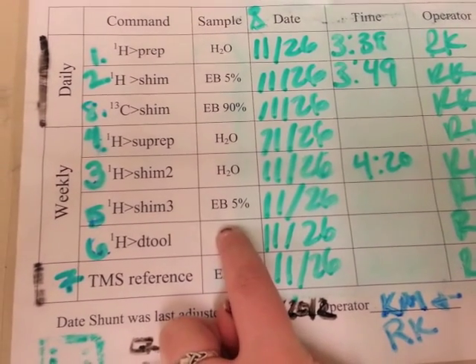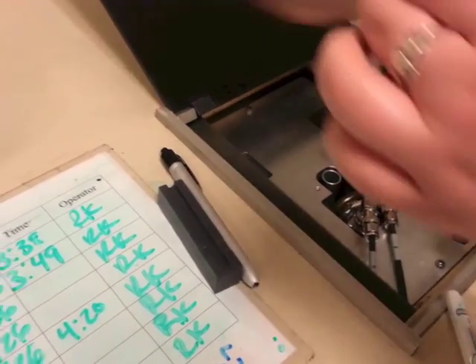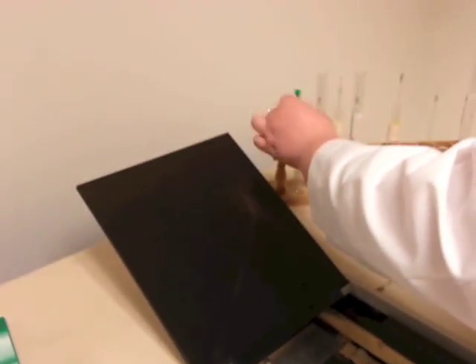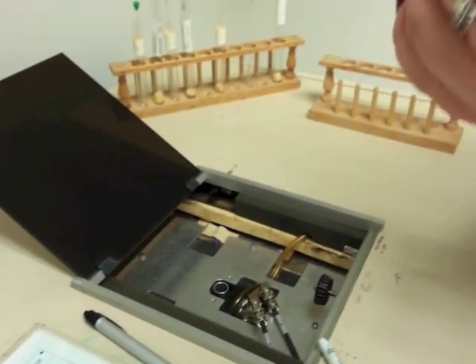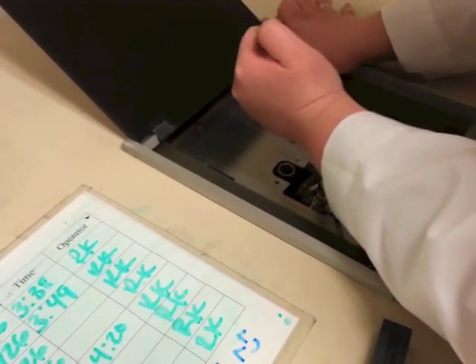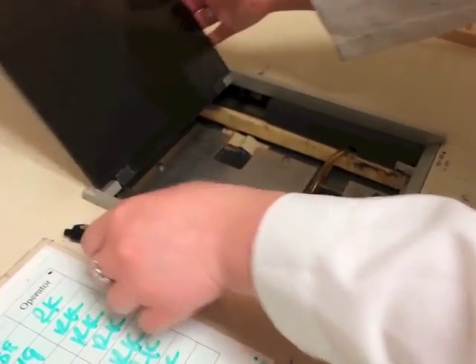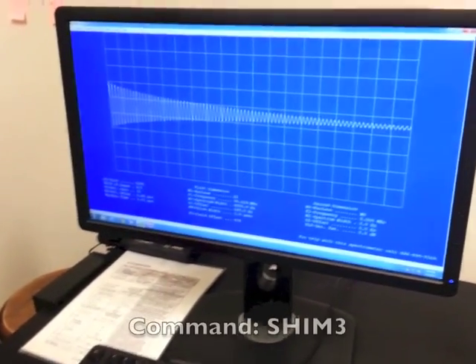Now it's time for SHIM3, which needs the 5% ethylbenzene solution again, so change that out. Then come over to the computer and type SHIM3.